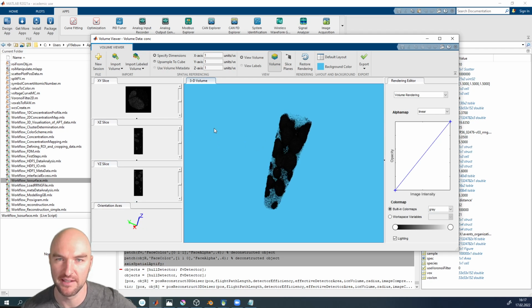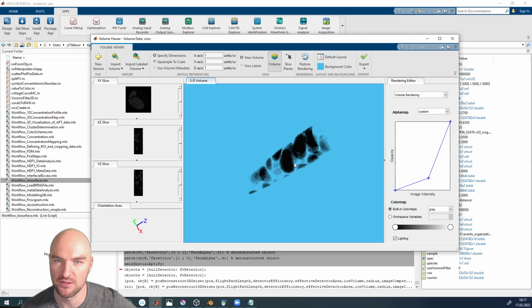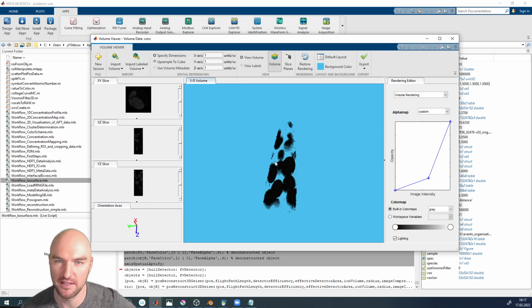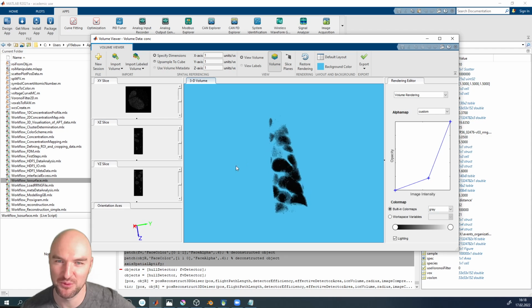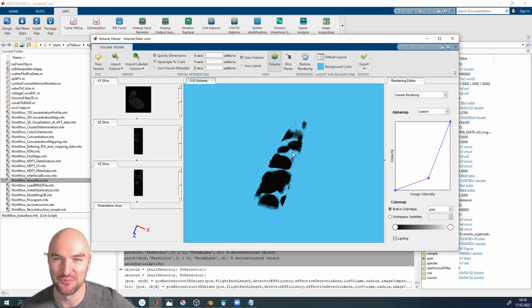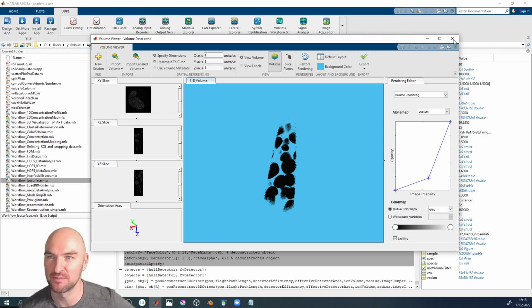And then you can already see, maybe that wasn't the stupidest choice. Can play with the opacity a little bit. So we already see our individual voxels here. So that's all good. But knowing that they should be kind of roundish, yeah, they don't look particularly roundish. Maybe not as bad as I would like them to be right now. Maybe I should have taken some worse reconstruction parameters. Anyway, we can always make stuff worse. That's always possible.